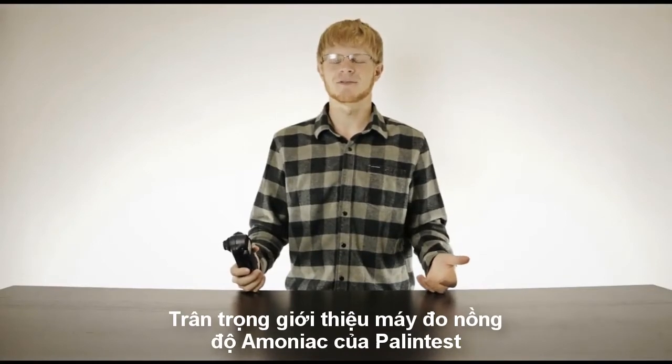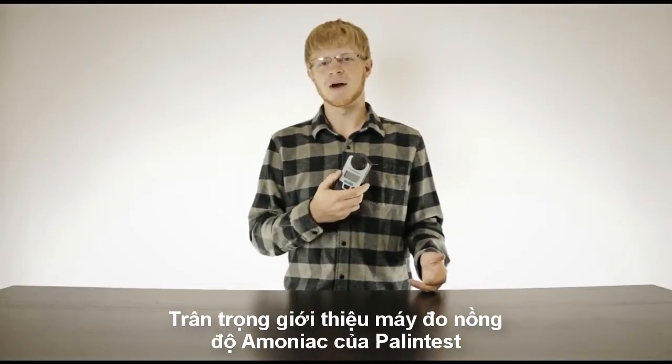For the longest time, I never thought I would do a video on a photometric ammonia instrument. Yet, here I am with Palantest's Ammonia Duo in the palm of my hand.